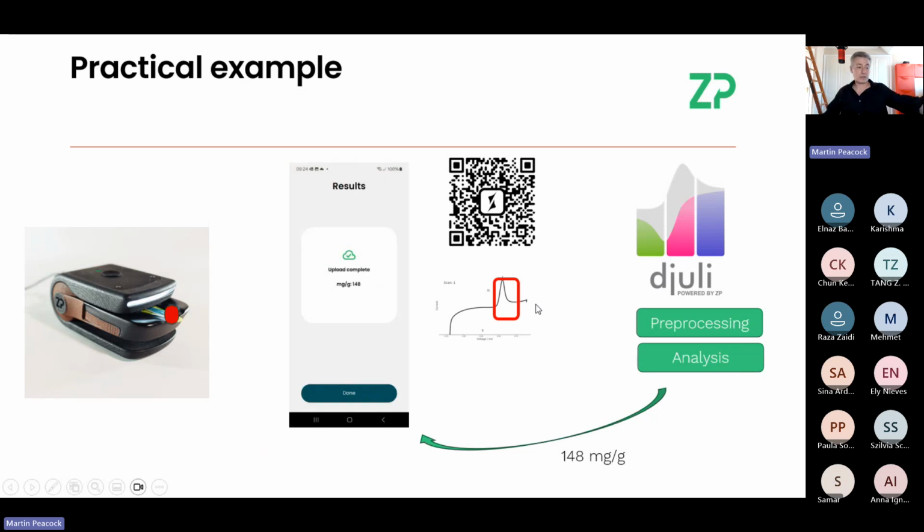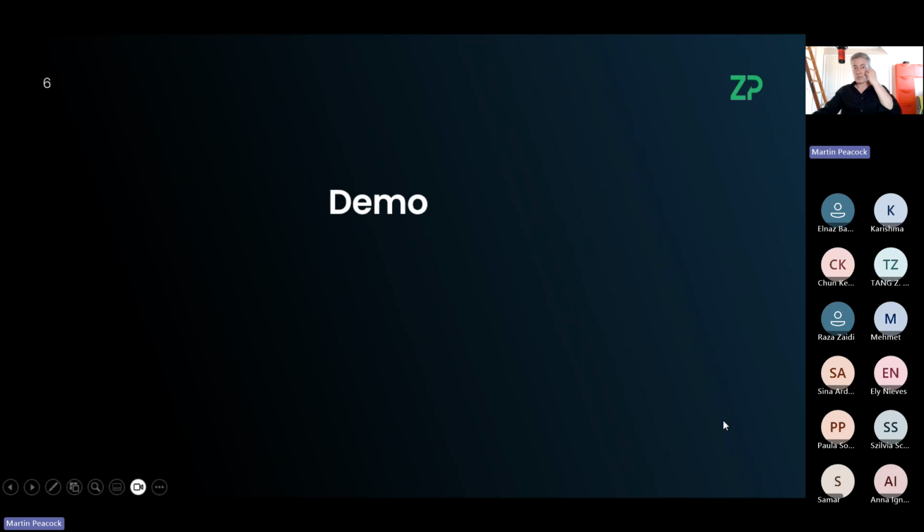So when I got that result on my phone of 0.261, that whole turnaround was from my phone up to the cloud, processing in the cloud, and back to my phone as well. So we definitely moved on from the world of glucose strips, where when these things were first invented, that whole workflow was not even possible. But we've reimagined what a glucose strip could do, imagined for 2025.